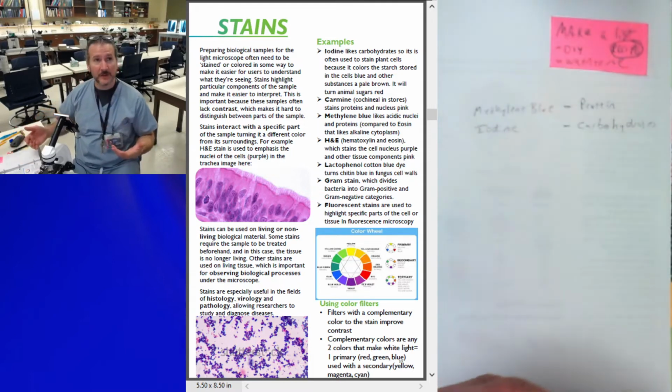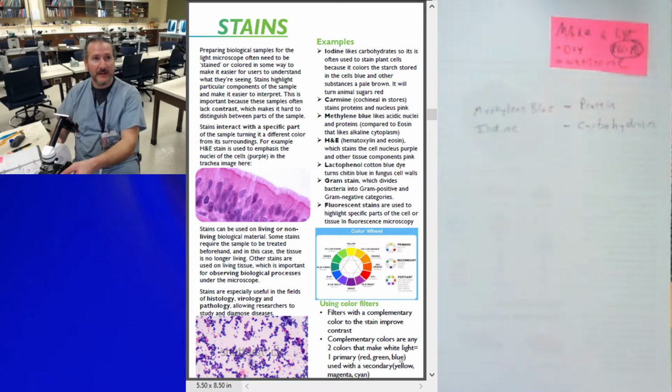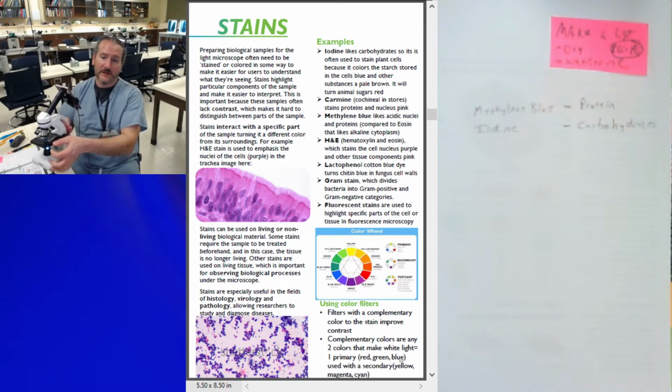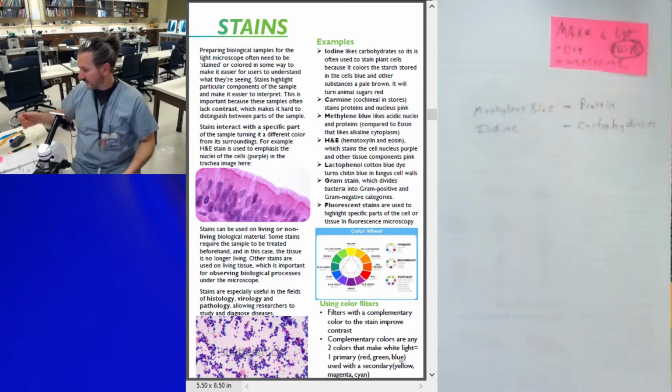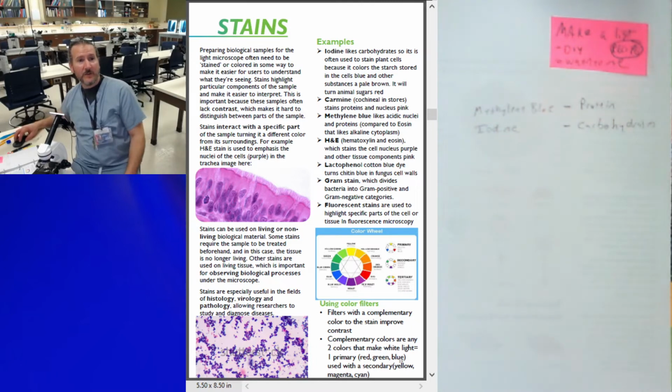Okay. Sometimes you can use a color filter. On the bottom here, on your diaphragm, you can turn this. The best way to do it is just push down a little bit on it and turn, click. Push down a little bit, turn, click. But sometimes you'll find the right filter to make it pop.